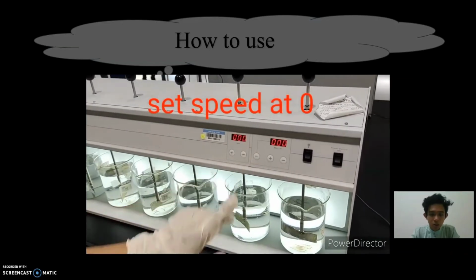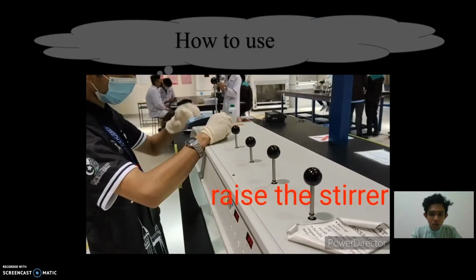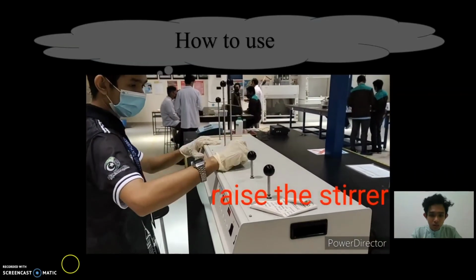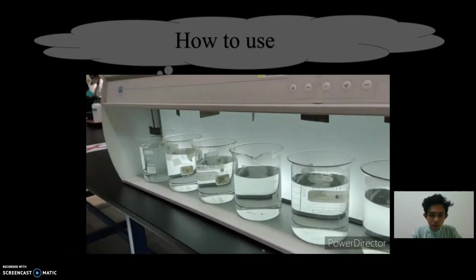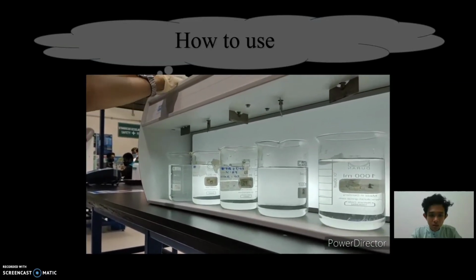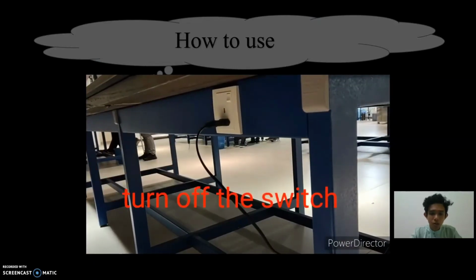And at the end we have to set the speed at 0 because we have to stop the stirrer and we have to raise the stirrer. And we have to press off the button light and the power and turn off the switch.